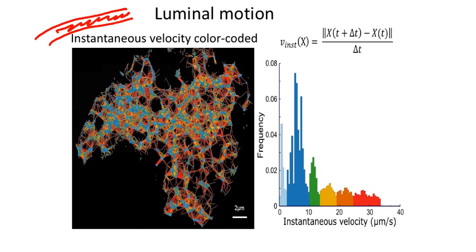The red color here characterizes jump velocity, that is, very high velocity, and as we can see here, they are mostly distributed between nodes. So at this stage, we can conclude that the topology of the ER is segregated into two parts. One, the tubule, characterized by high velocity, and second, the node, which is the intersection of the tubules or the sheets, that are characterized by a low velocity.